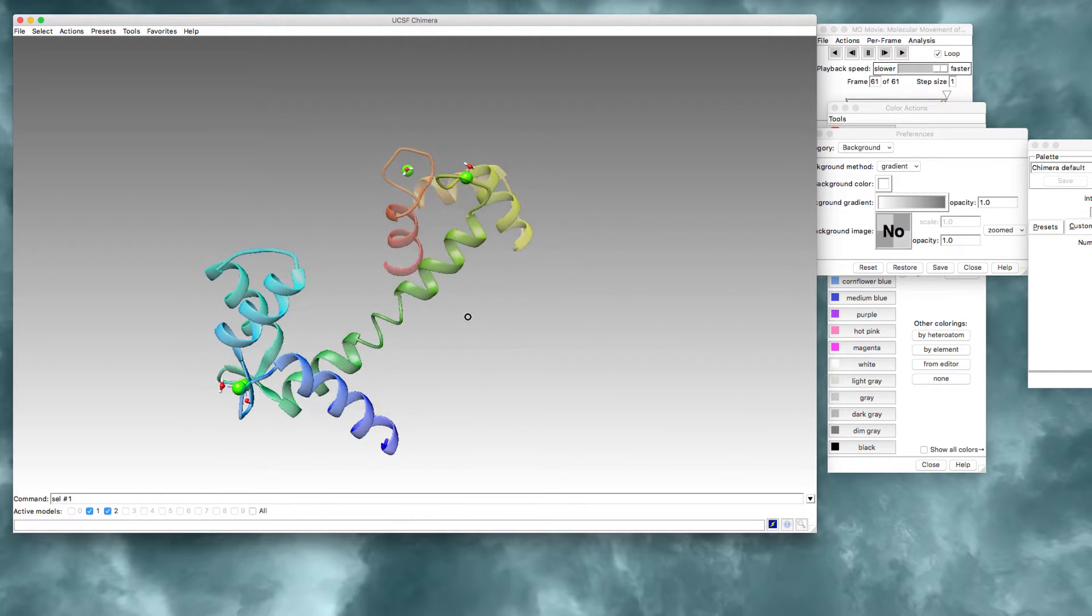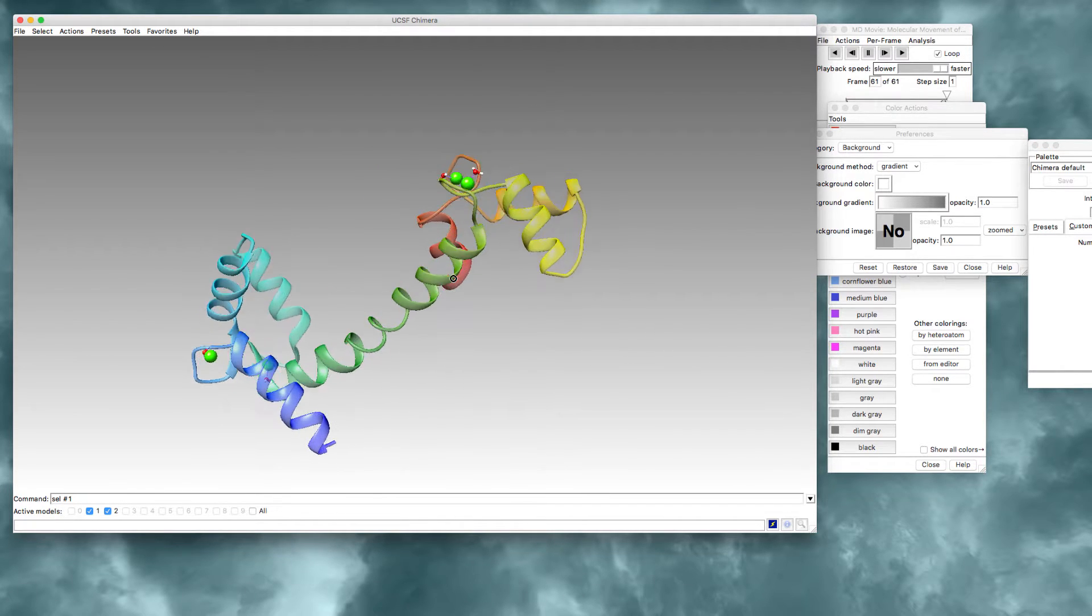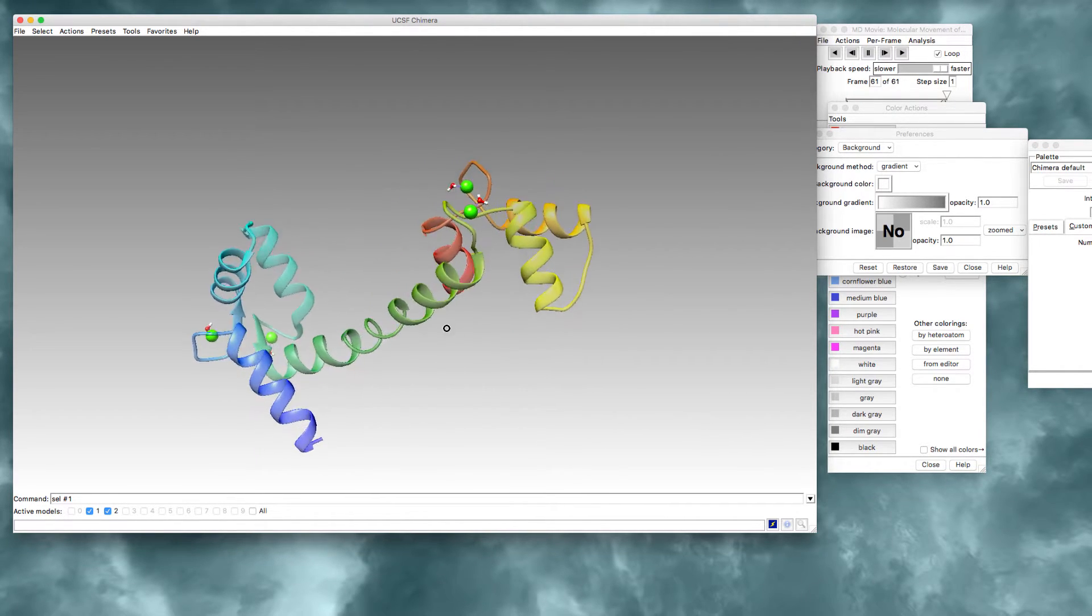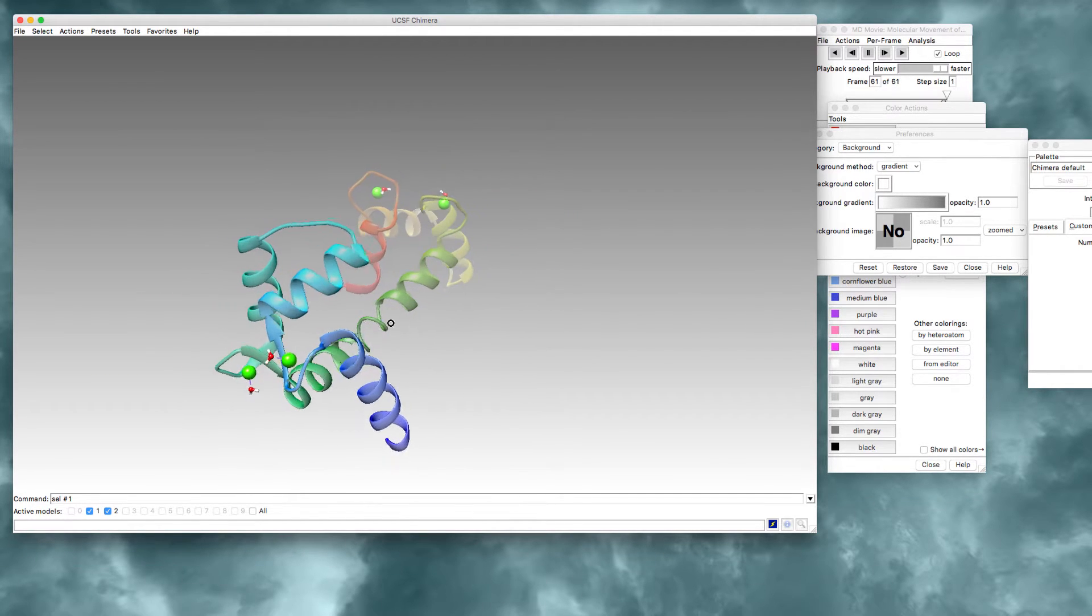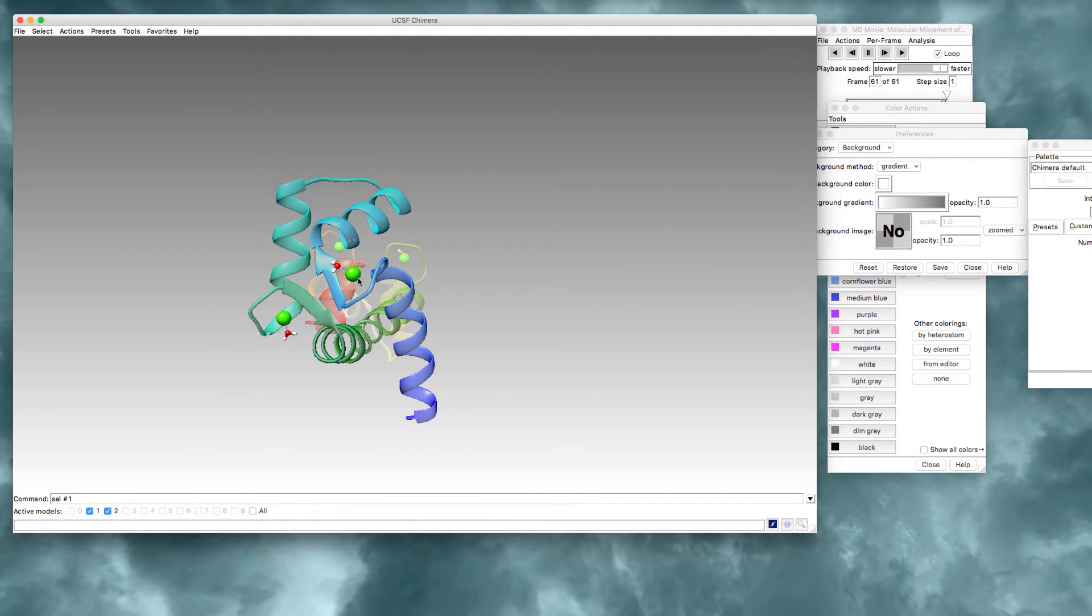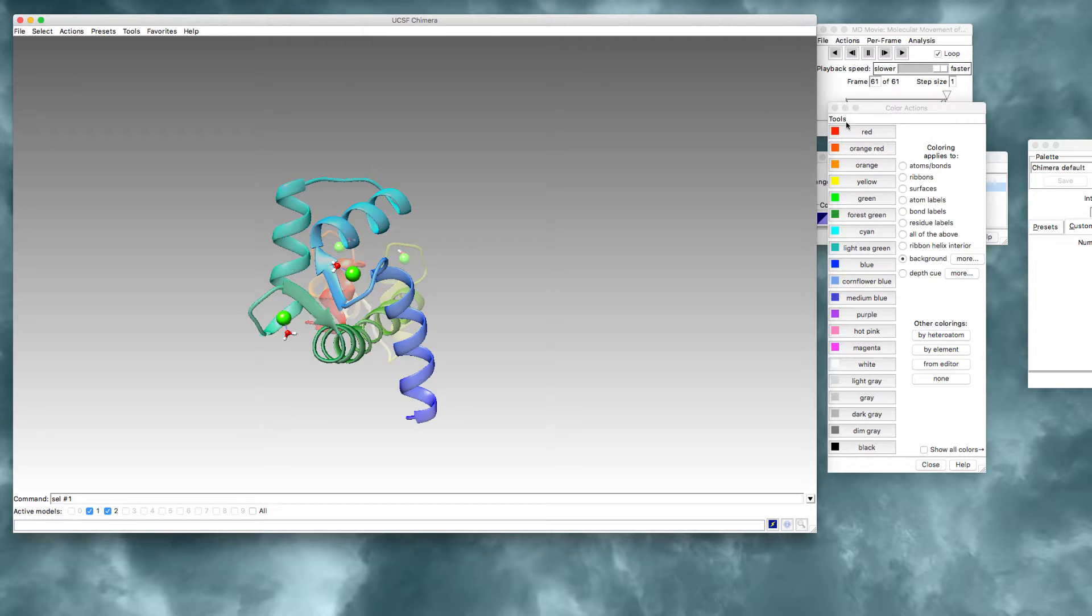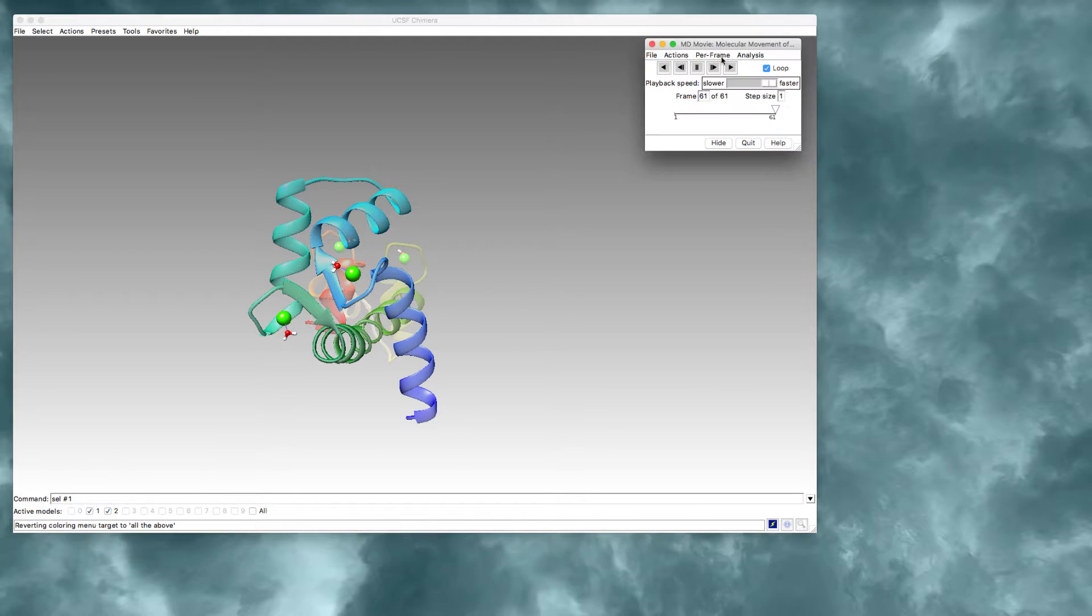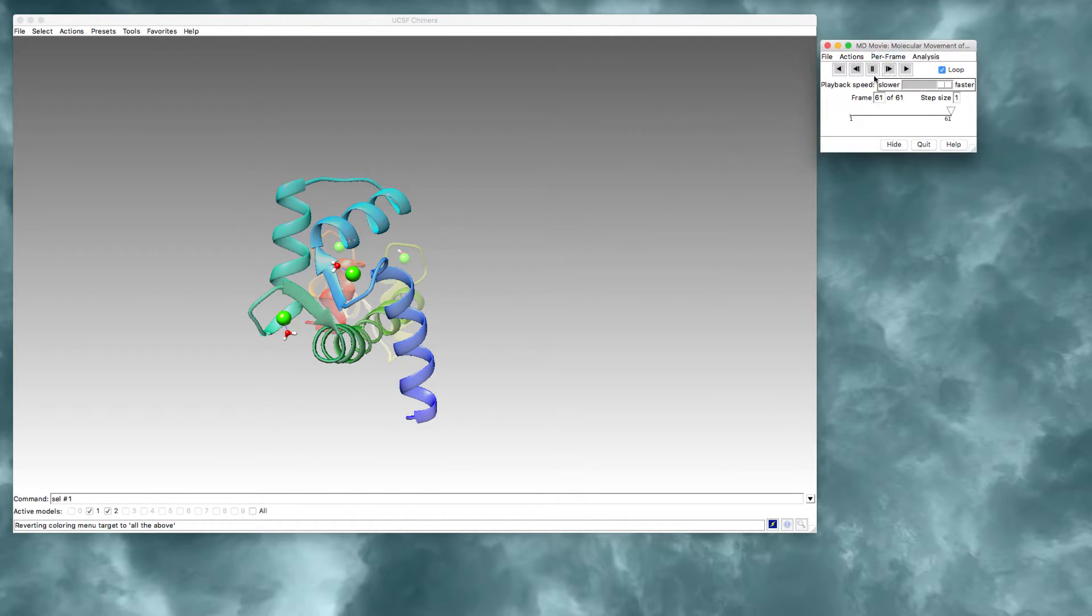So the last thing I'll do is I will want to show the side chain atoms that are binding to my calcium. I'll close the unnecessary windows at this point. I'm not going to close my molecular movie animation window. I need that to be visible so that I can see the morph.